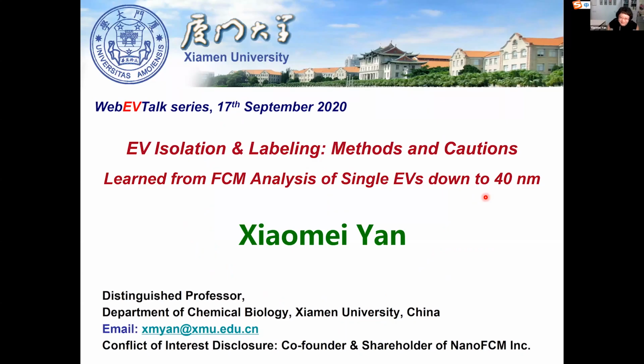And thank Carolina for the nice introduction. Hello, everyone. Like what Carolina just said, yes, we have developed probably the most sensitive nano-flow cytometer. This instrument provides us a very unique opportunity to have a good view of the full picture of EVs. And today I would like to share with you the perspectives. I add isolation besides the labeling.